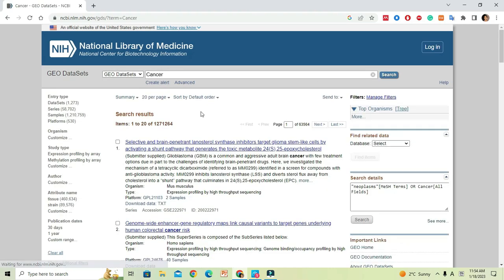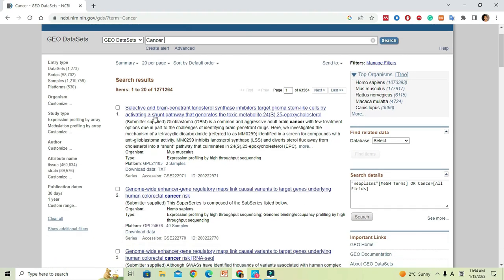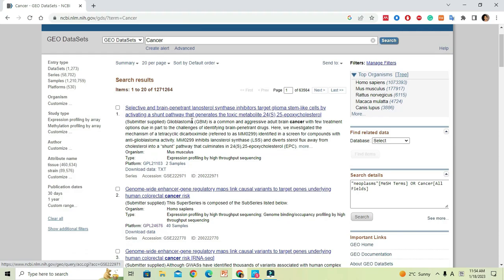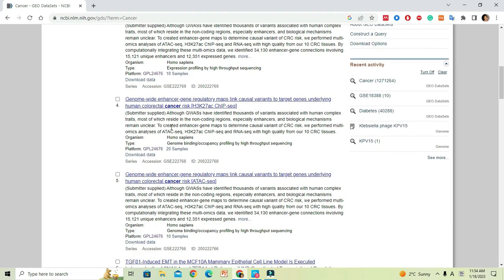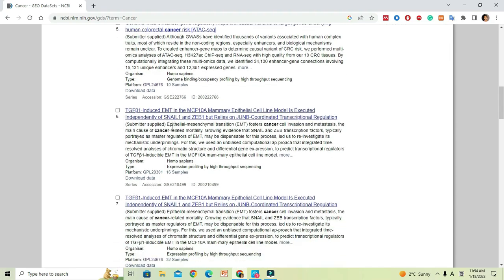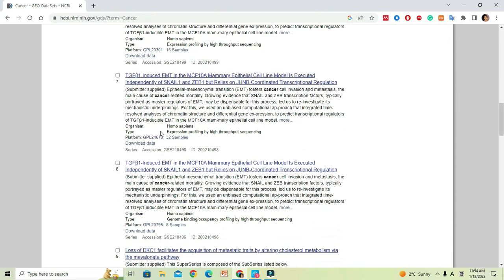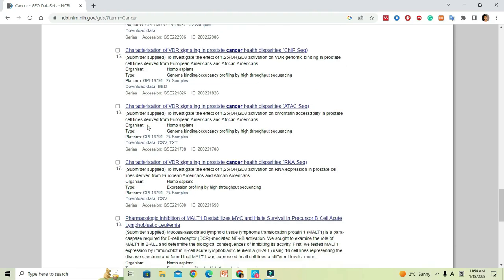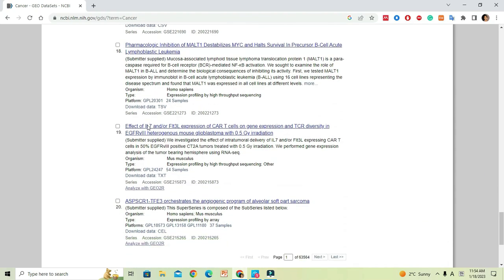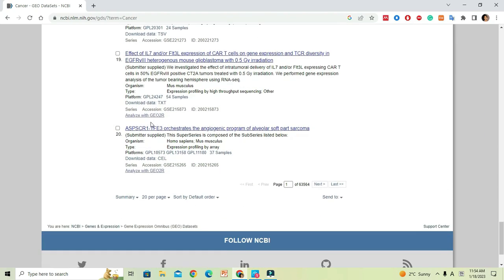That will populate a large number of expression studies related to cancer. If you scroll down on the datasets, you will find some of the data associated and analyzed with a GEO2R link. Just click on the link.